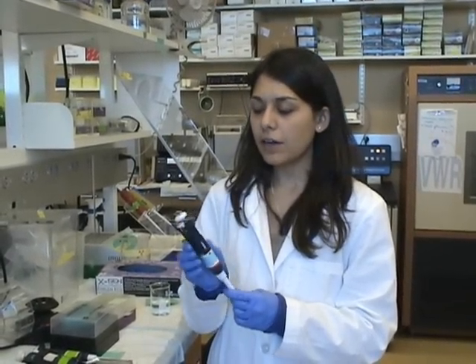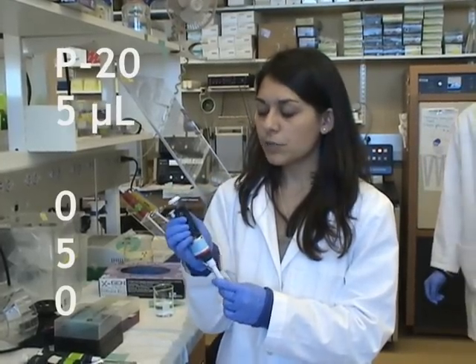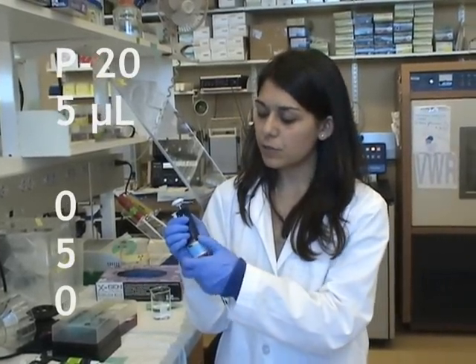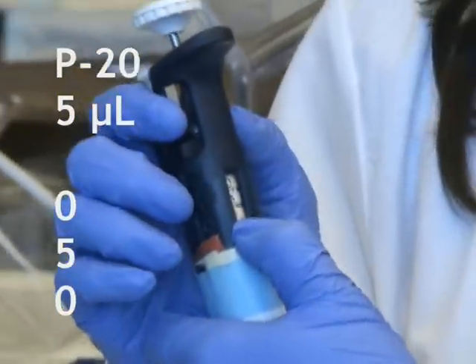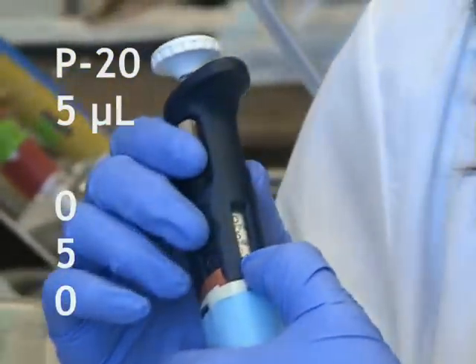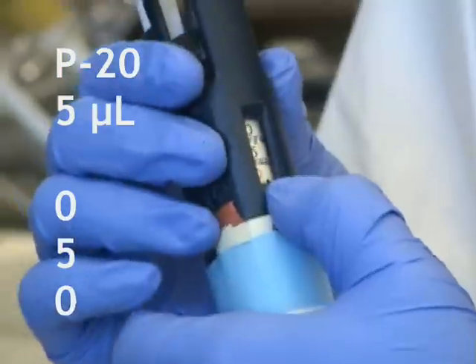So let's go over the P20. Like I said earlier, this measures 2 to 20 microliters. The first thing we want to do is set it — we're going to set this one to 5 microliters. We set it to 0, 5, 0. If you notice, there's a decimal point at the bottom, and if you look closely, the last number is indicated in red. So this would be 5 microliters.